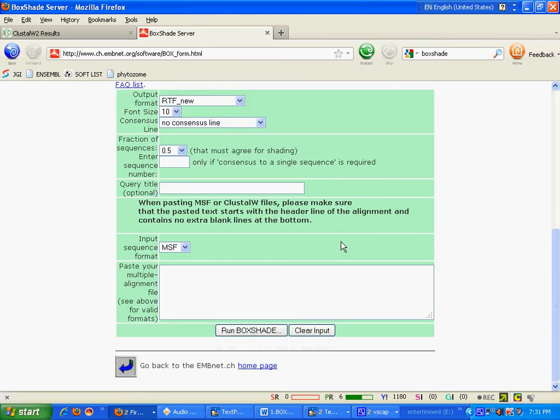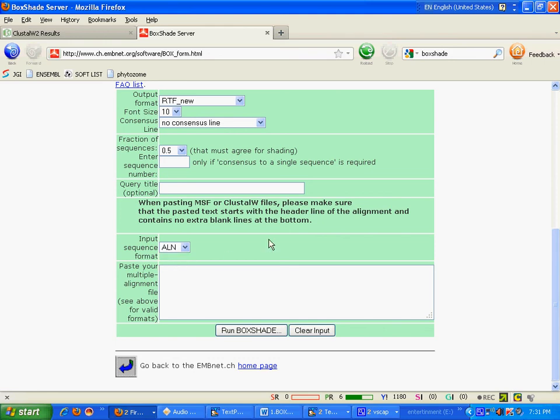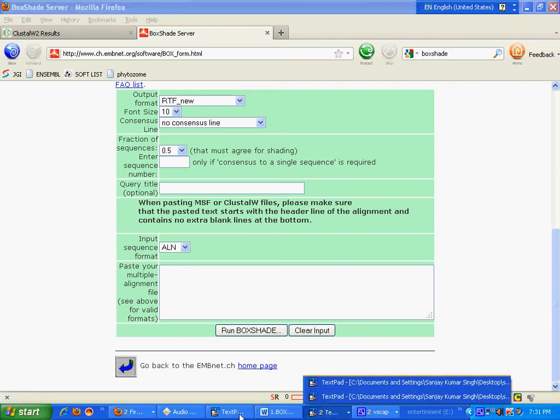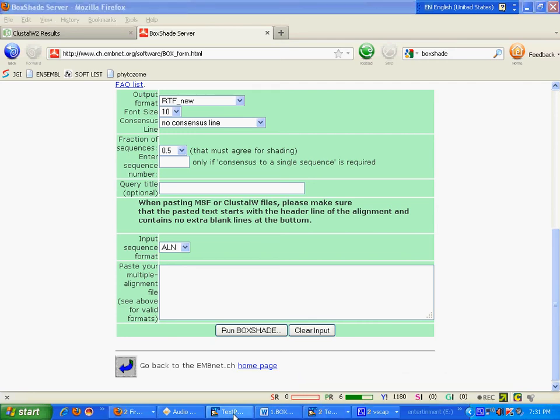Then I will select here alignment input sequence format, which is the ALN file. Now I will paste my multiple sequence alignment file.